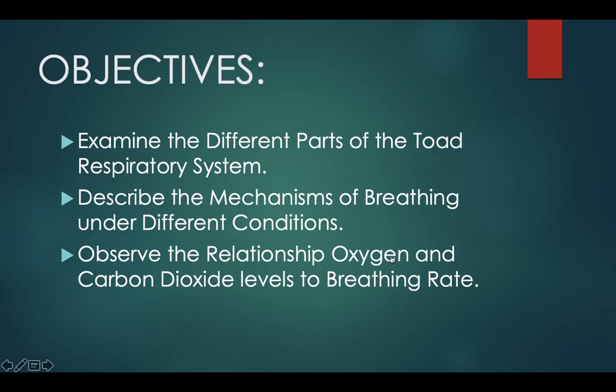Let's start with our objectives. Our objectives are to examine the different parts of the toad's respiratory system, to describe the mechanisms of breathing under different conditions, and lastly, to observe the relationship of oxygen and carbon dioxide levels to breathing rate.